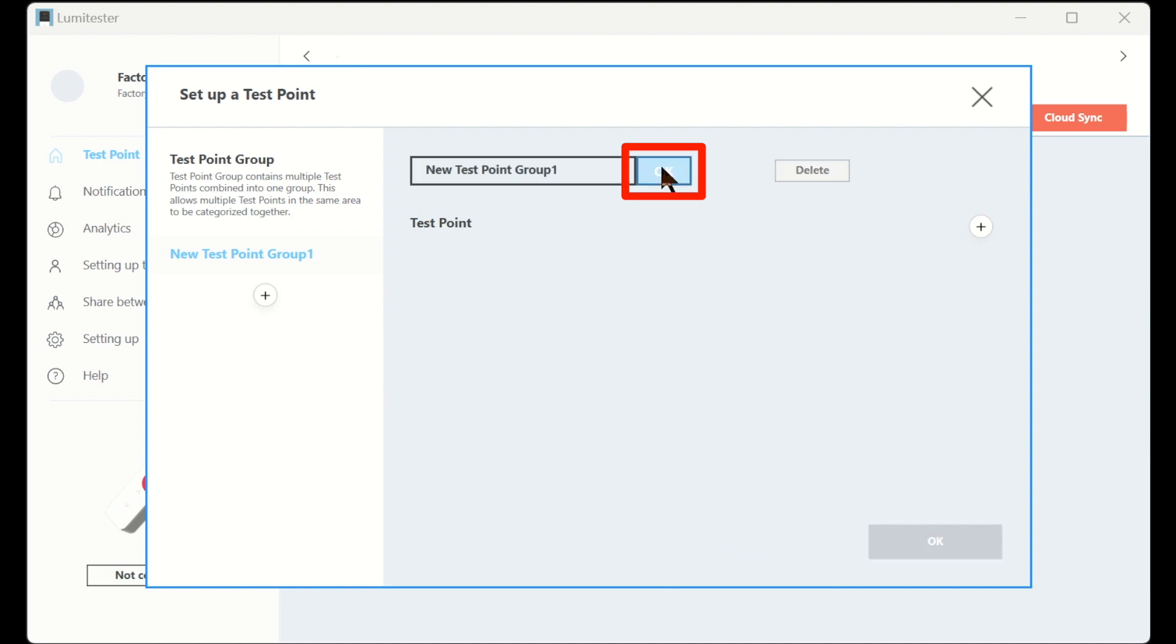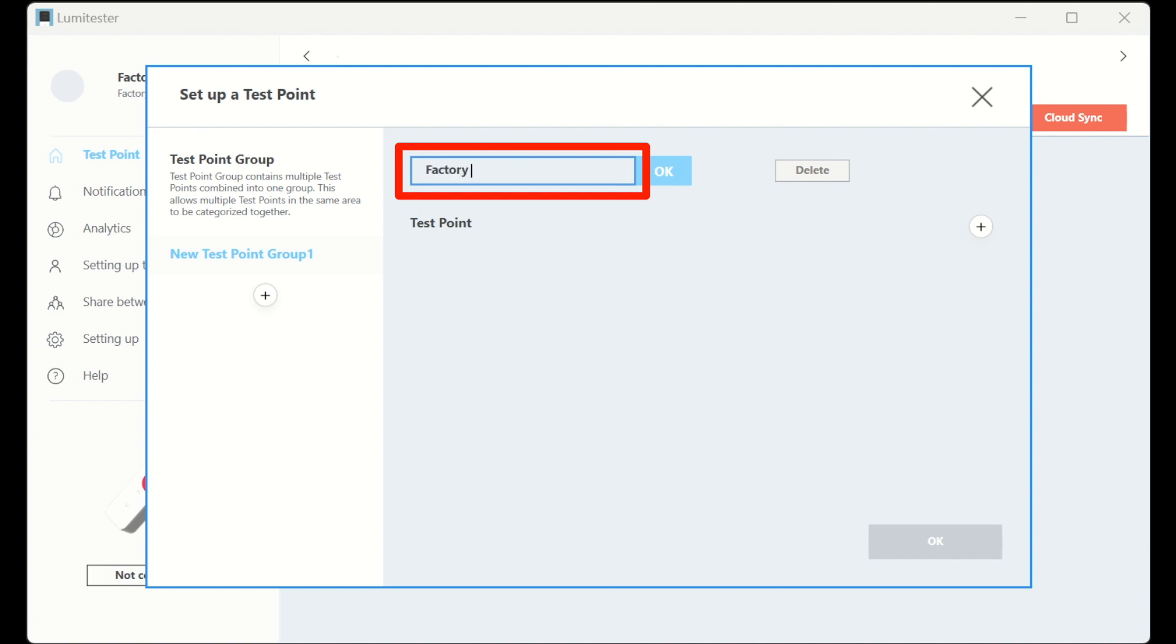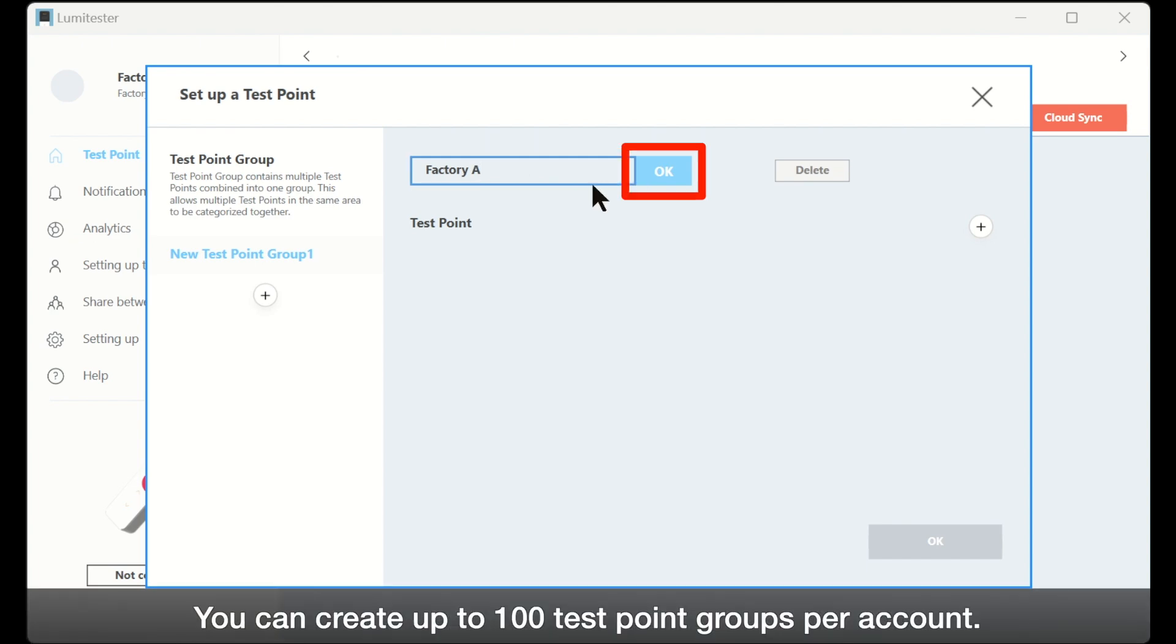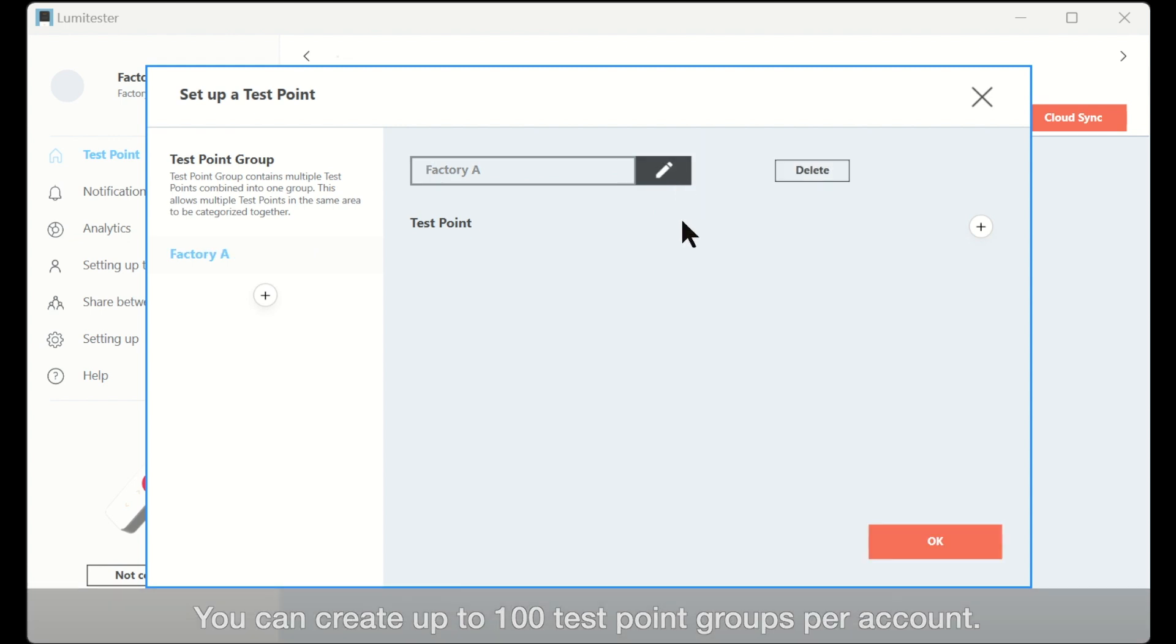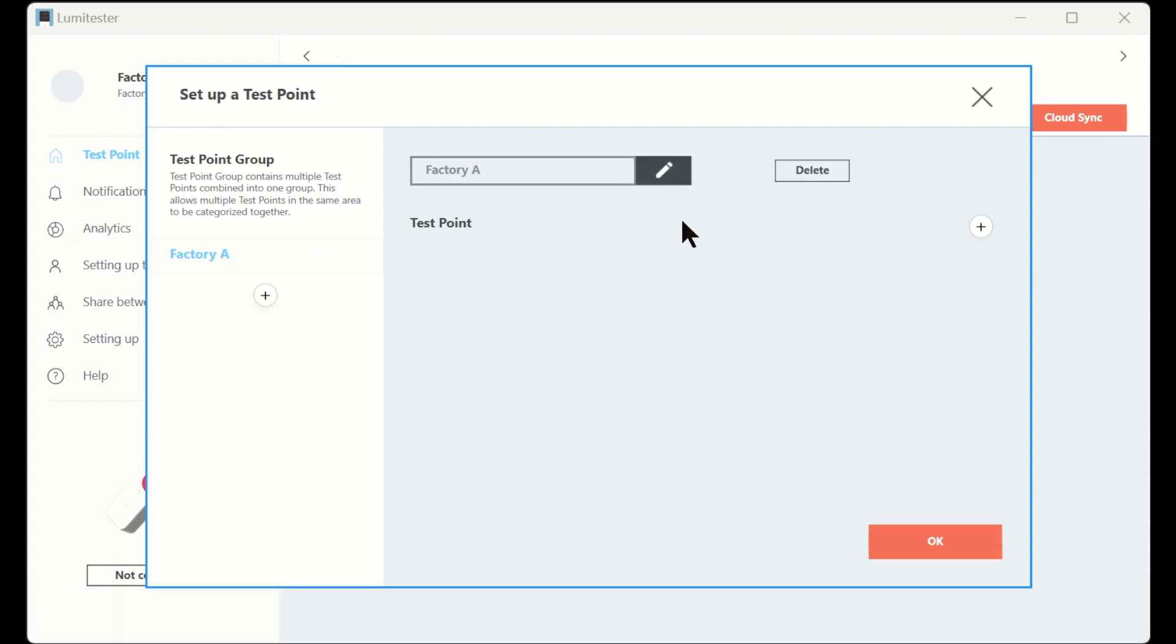Up to 100 test point groups can be created per account. It is recommended to use the deployment name or plant name as the name of the group to make it easier to find. In this case, we'll name it factory A.